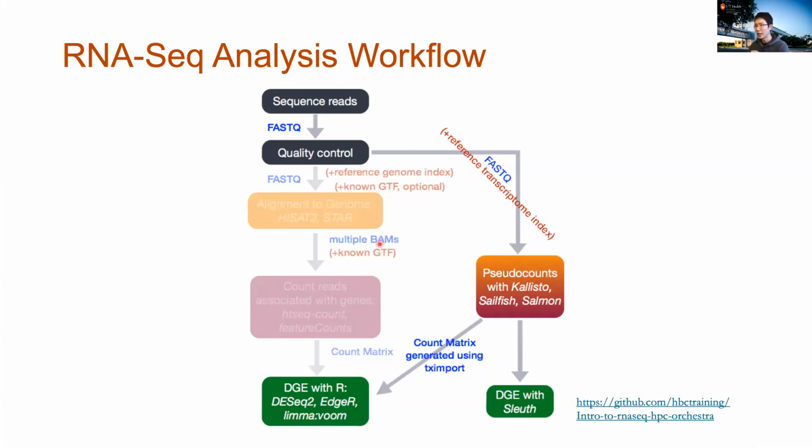Typically, for each sample, those tools take a couple of hours, a few hours on a high-performance computing server. So it takes some time, but it aligns everything back to the genome. So it provides you the chromosome location of your sequencing data.